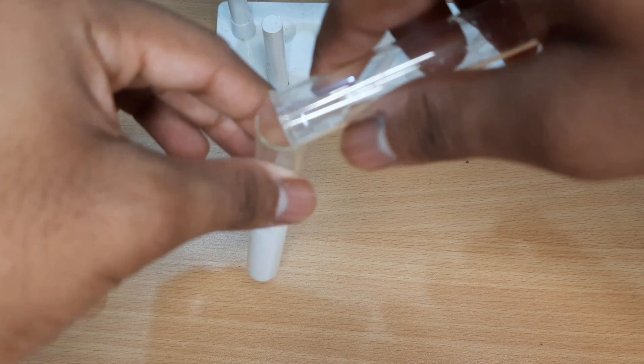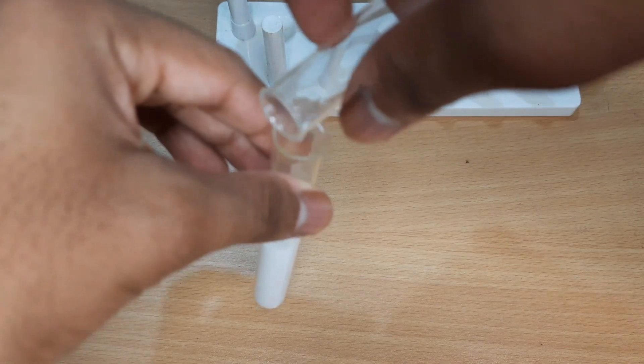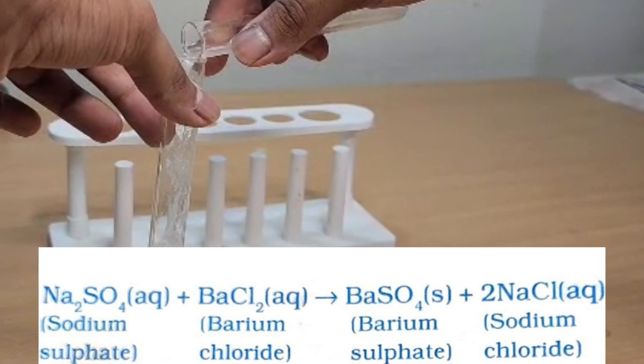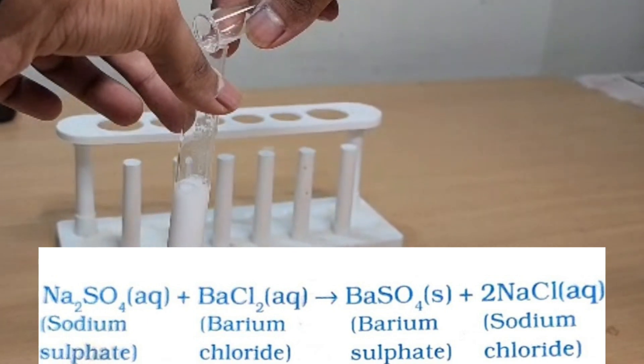A white substance which is insoluble in water is formed. Here barium chloride and sodium sulfate react to form barium sulfate and sodium chloride.